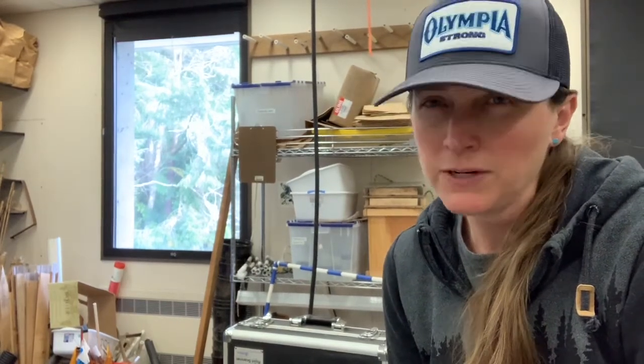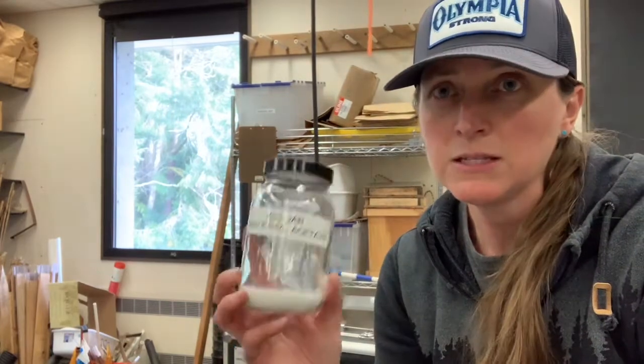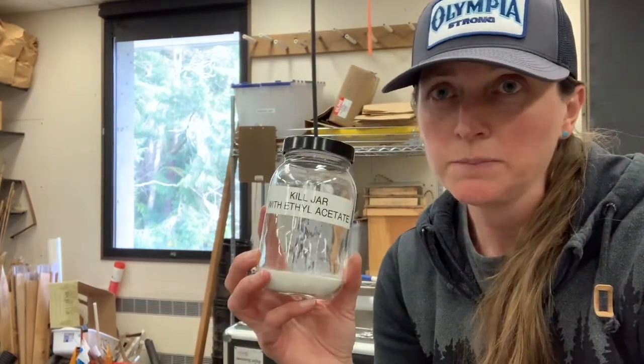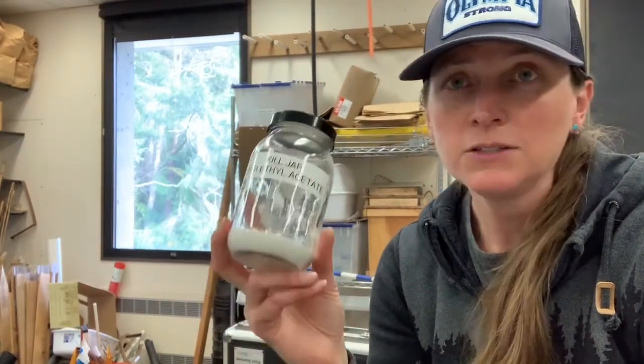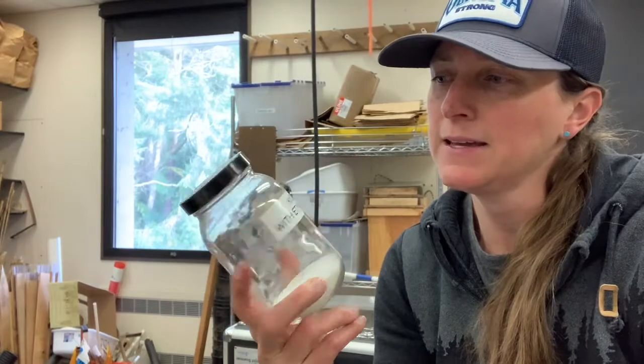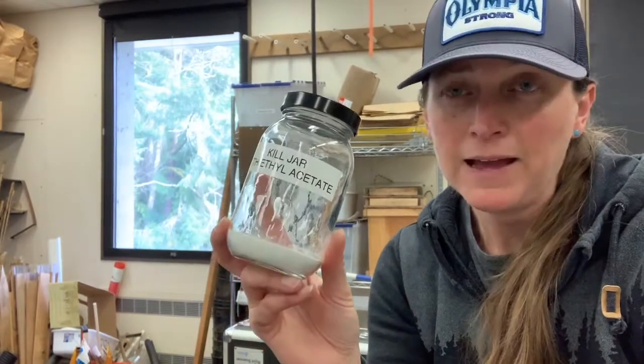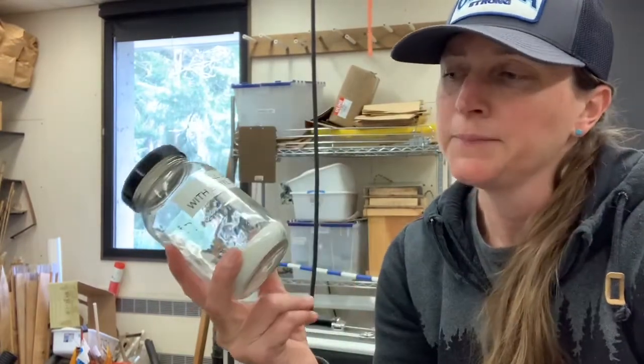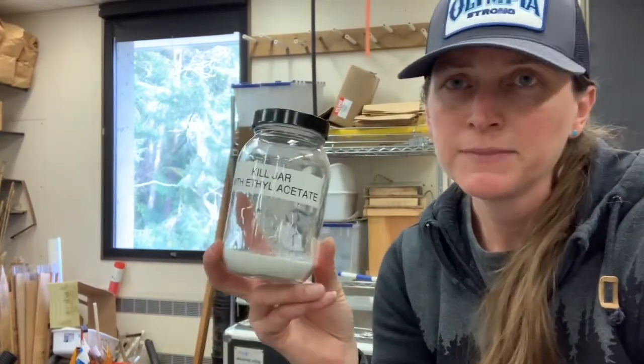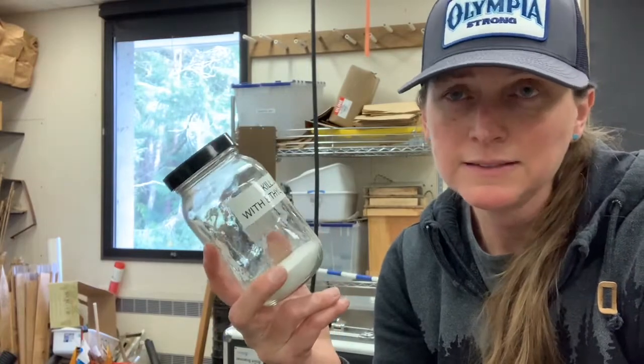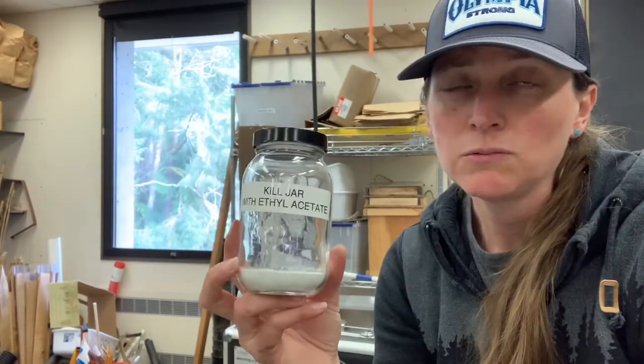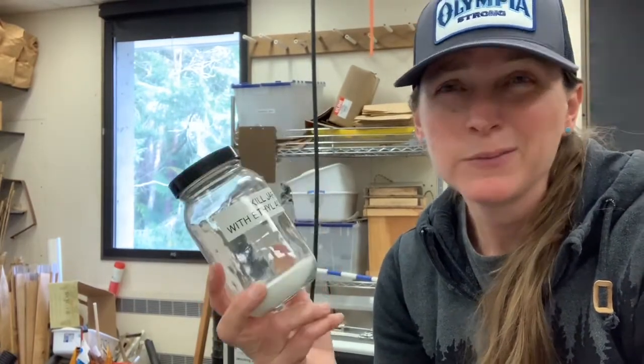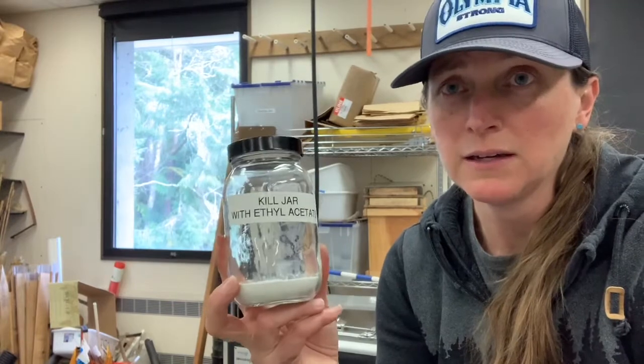If you're collecting terrestrial organisms, then the best way to preserve them or to actually kill them first if you're going to preserve them is in a kill jar. So a kill jar is just a jar and it has, in this case, ethyl acetate in the bottom. This is a substance that kills the insect without damaging them, so then you could pin the insect later.